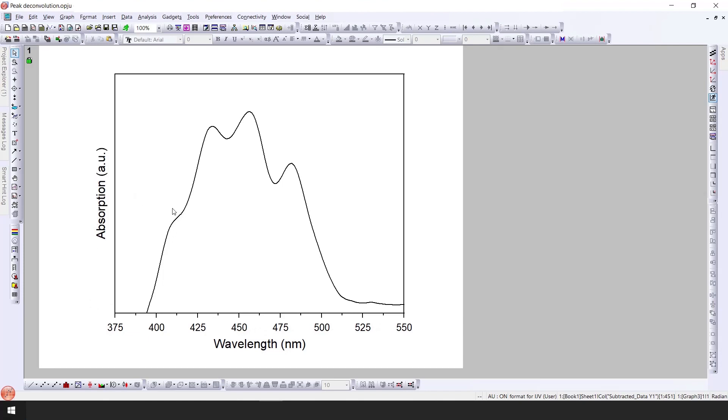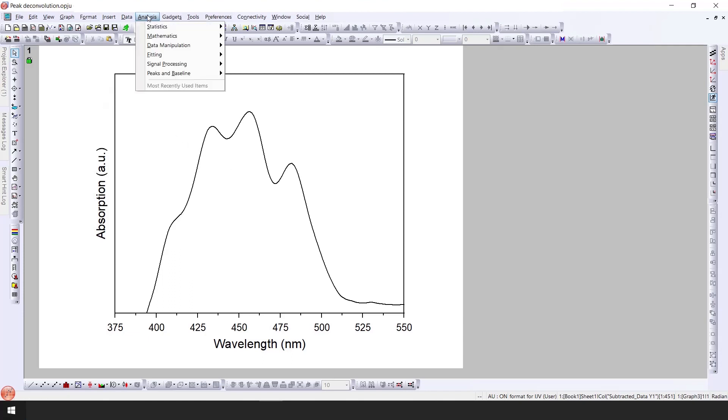You can see here this is the shoulder and we have three clear peaks. We want to decompose this whole spectrum into different peaks. The first step is to click on the analysis.